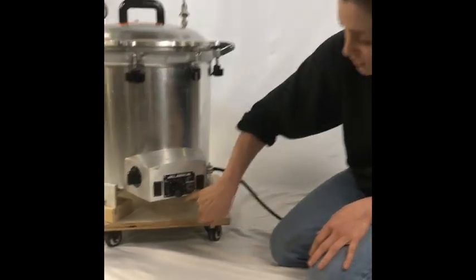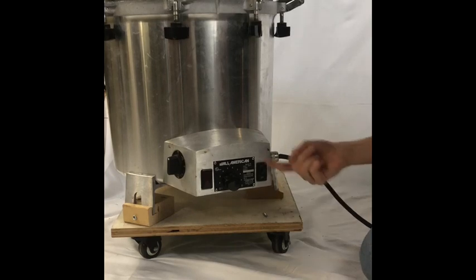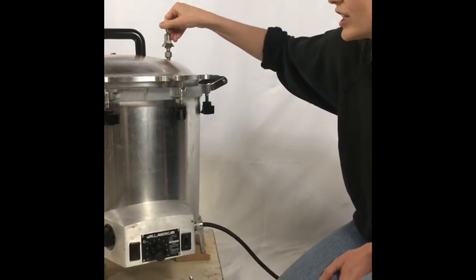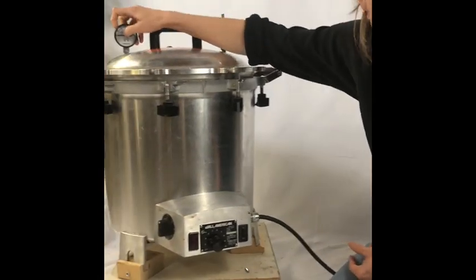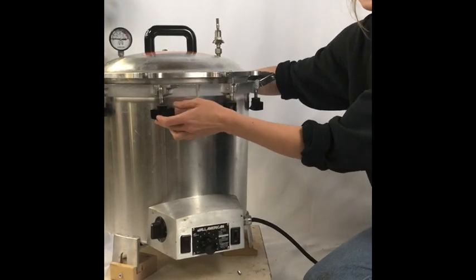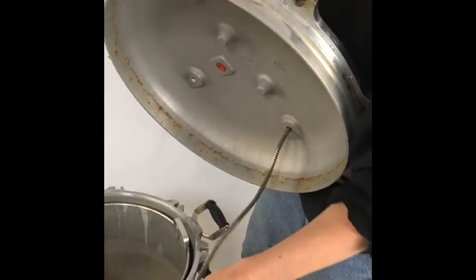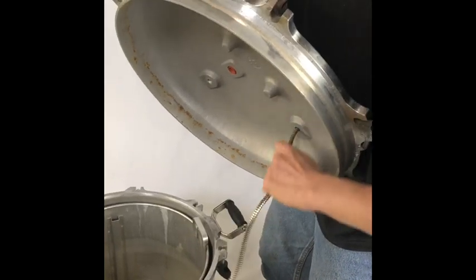Here we have the dial — this controls the heat. There's the light which indicates that it's on, and of course the on/off switch. Up here on the lid we have the valve, which is where you initiate and release the pressure building. Then our gauge, which is extremely important. We have wings on all sides to help tighten. And inside there's this little snake, which will pull the hot air.